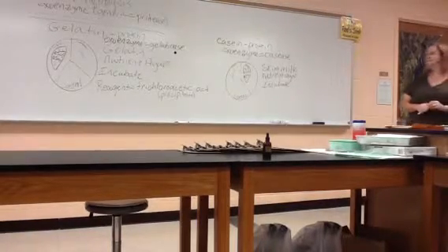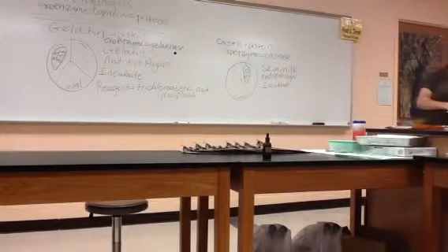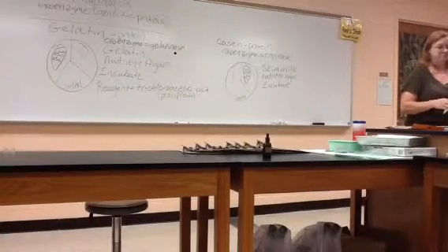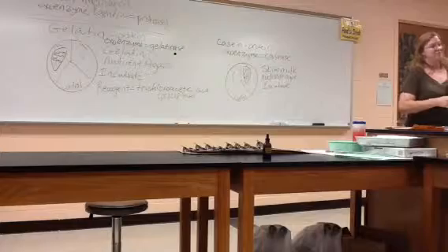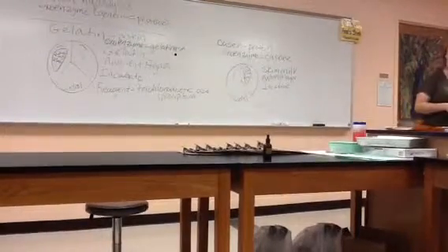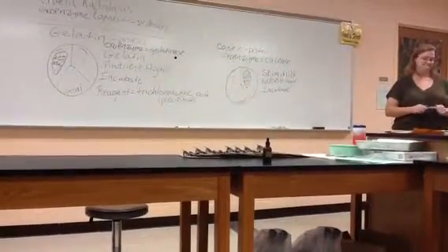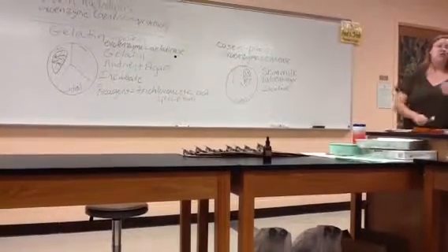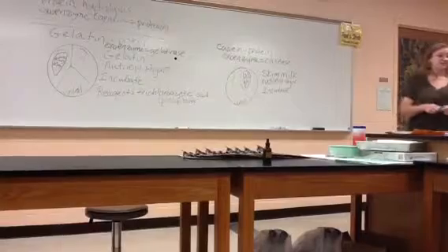Okay. So what's negative going to look like? Regular white. It has white color around the bacterial growth. And that means it did not produce casease. Good. And that one's on page 62 of your photographic atlas, the casein test, page 62.